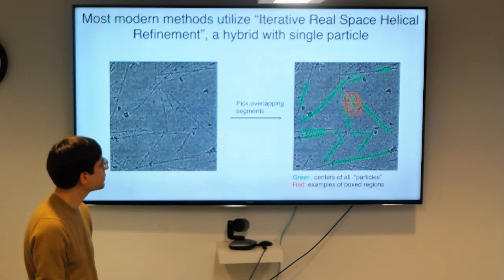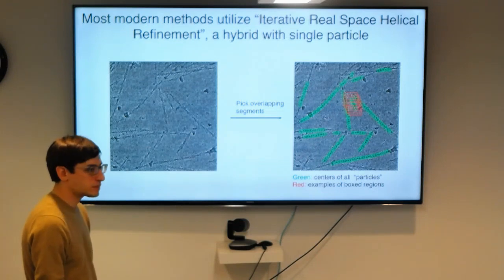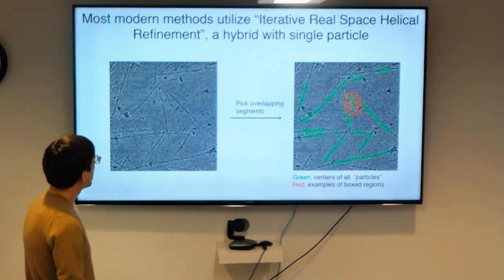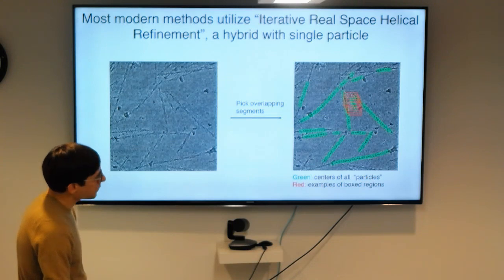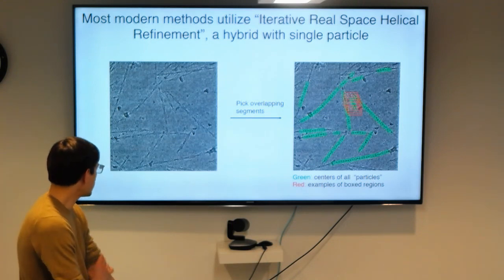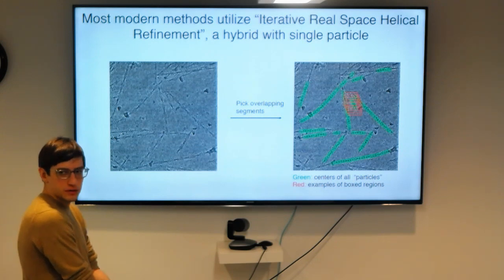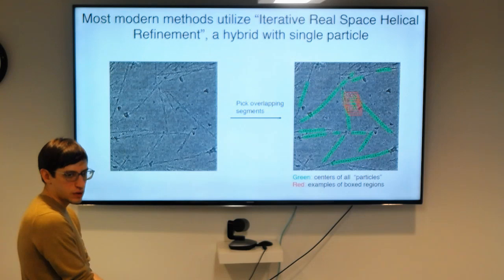One more. Would you be able to guess, just by a scale bar, what the separation, the rise, is from the protomer here? If you were to just guess, what would happen? Yeah, that's a good question. You might be able to guess in this case because it's a pretty simple helical structure.